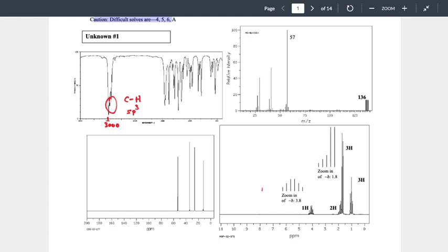Right? You don't have that experience, at least the vast majority of the class doesn't have that experience yet. So you need to start building it. This means looking at multiple spectra, finding them online, okay, and finding them with structures tied to them. So you start getting used to the patterns that go with it. The spec background document has several representative shape patterns that you should be using. They're not perfect. They're representative, and I'm trying to do the best that I can. And if we look within those examples, that's what we're trying to use to help identify these shapes. Make sense? Okay, next part. Cool, you analyze that. Are there other peaks?